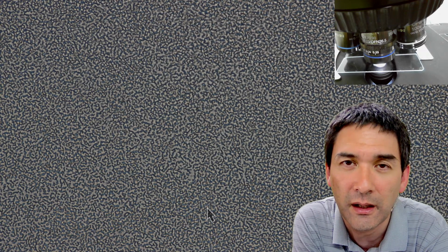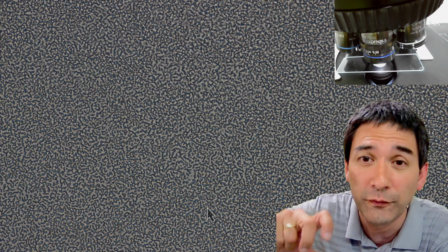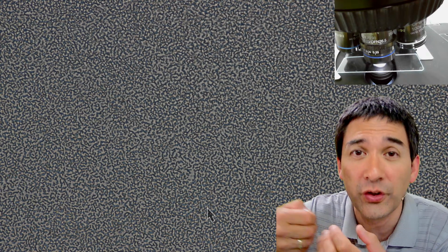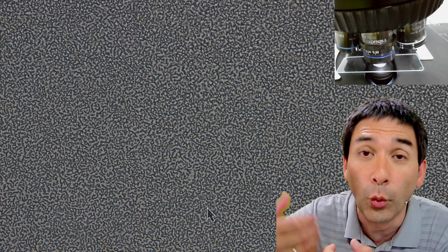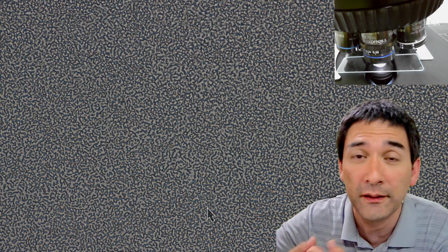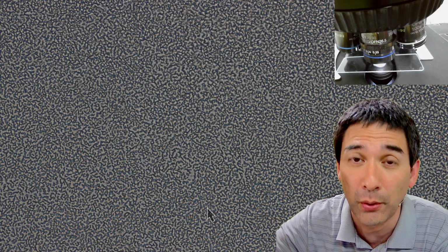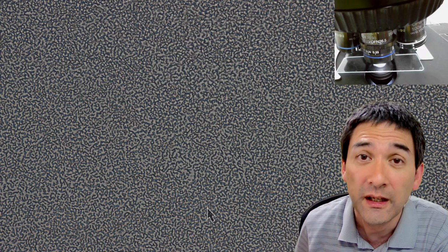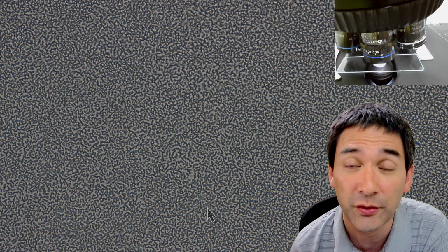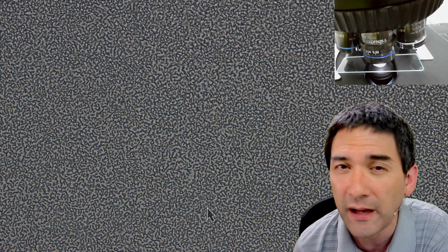And yeah, I got it for free because it didn't work anymore, because I could not turn the focus knobs anymore. The reason I could not turn them anymore is because over time, the oil in the gears starts to turn hard and solid. And getting it fixed, you have to give it to a service company who takes it apart, cleans it, re-lubricates everything. And this cost me 200 euros. Simply getting it properly cleaned. Now it works very nicely again. But this microscope, I think, is from the middle 1970s, 1975, 1980s.